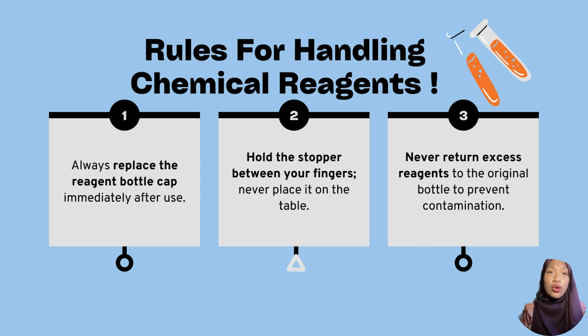Contamination means something dirty or unwanted gets mixed with the chemicals. And finally, never return any extra reagent back into the original bottle. This is to keep the reagent pure and safe for other people to use later.